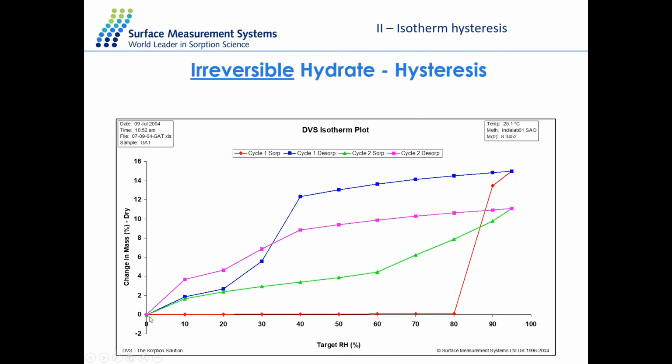I can dry it back, but then whenever I put any more water into the structure, the sample goes back up. It doesn't have that nice surface absorption that I had when the material is fresh and as prepared. It lost the stability that it used to have in the initial cycle. So that's something that is very important for the study of stability and storage condition of this type of material.